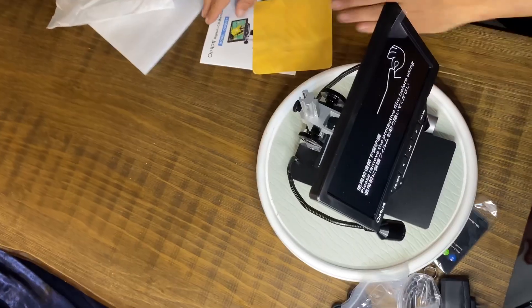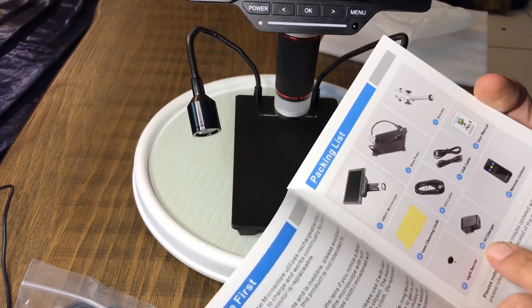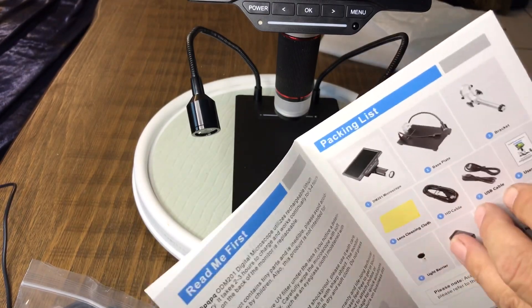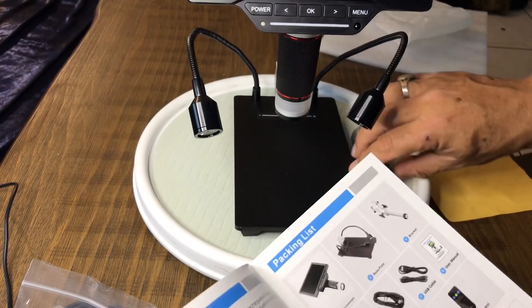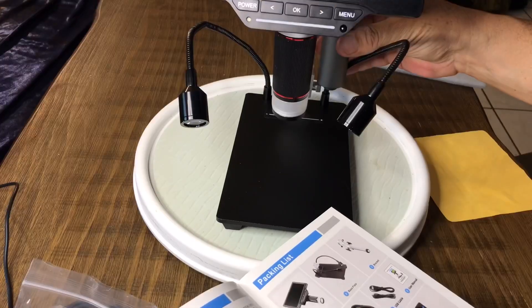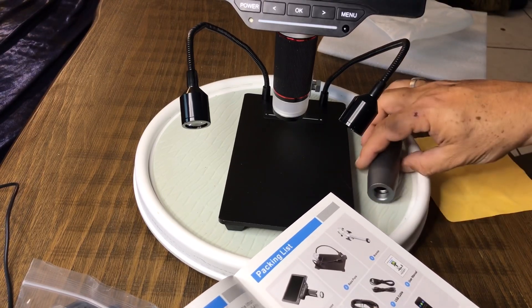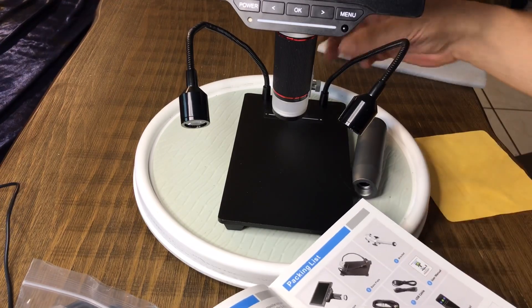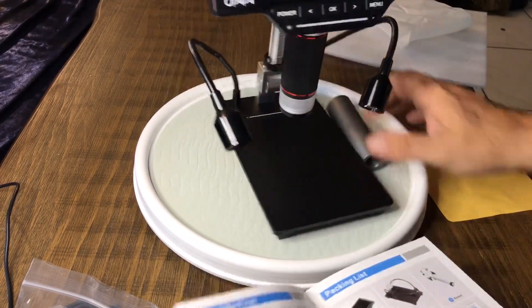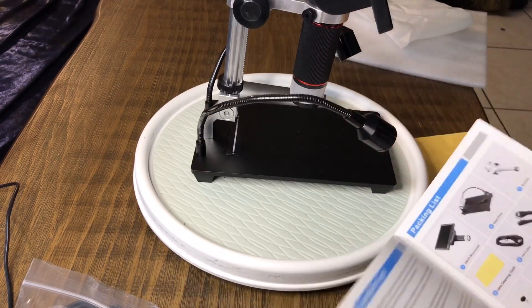Now let's take a look at the manual real quick to find out what this metal piece is. Interestingly enough, it doesn't show it in the packing list. You know what — maybe it's an extension. It's an extender so you could get up even higher. That's probably what that is. Also noticing that this is adjustable — it's got a bolt on the side that you can loosen up and tilt. So if it wasn't quite square or you wanted to do something different, you could.